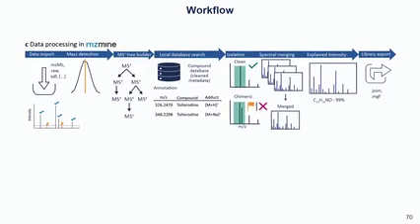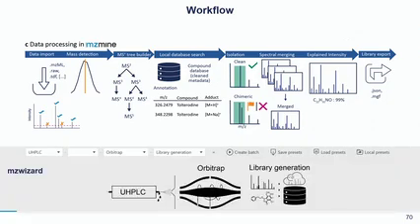The last important thing is then the processing in mzmine, and this was involved with a co-collaboration with mzmine as well. So the things that you did today with LC-MS, you can also just do, and then instead of the data-dependent acquisition, you set the system to, I actually created a screenshot, so you can set it to library generation workflow, and then you export everything that was annotated with the compound database file. You then export it and then have it as an individual file, and then you can share it with collaboration partners, you can use it in your lab, and so on.